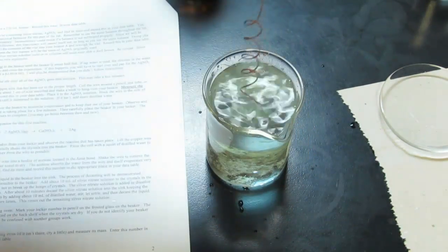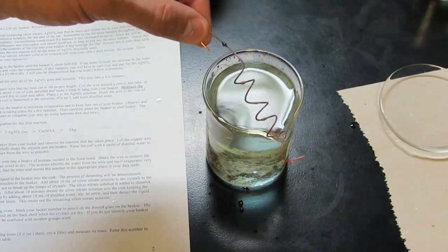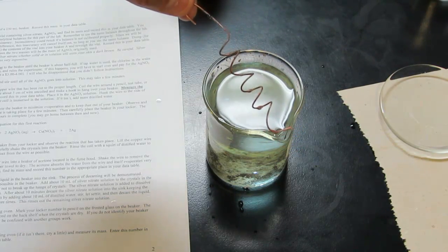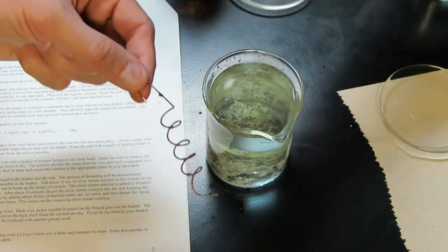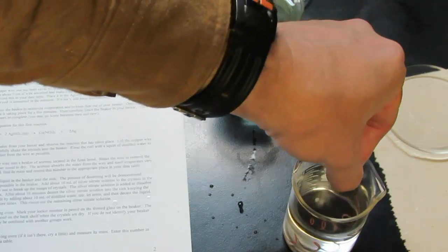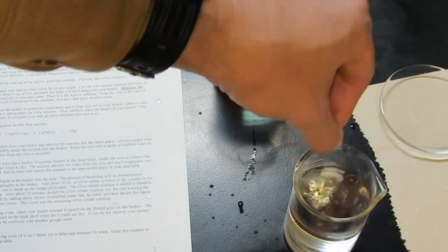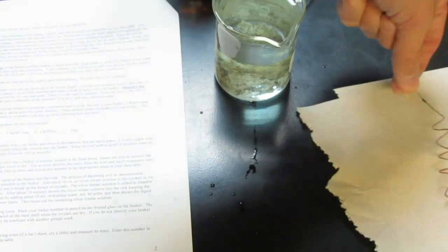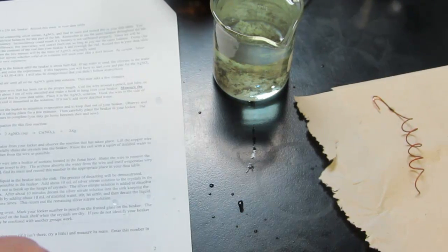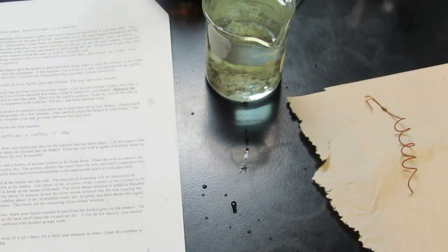Since we need to find the mass of this copper wire so we can determine how many copper atoms went into solution, we're going to dip it in acetone. Acetone adheres to water molecules on the copper wire and evaporates very quickly. We'll give that a good shake and then put that copper wire on a paper towel and let it sit for a few minutes. As it sits, the acetone evaporates and pulls water molecules away with it, so it dries it nice and quickly for us.